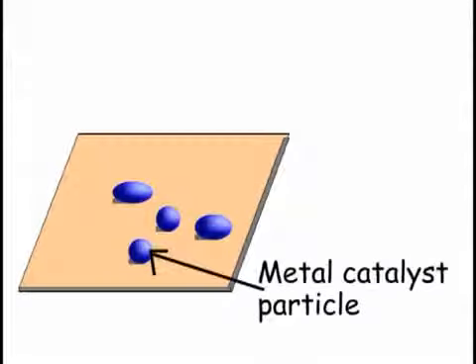In this case, the starting material is not graphite, but some carbon-based gas, a hydrocarbon. We also need a metal catalyst to form tiny particles which will act like seeds. In this CVD machine at Oxford University, the metal is included in the starting molecules. They use ferrocene, which contains one iron atom per molecule. The young scientist takes a clean tube and sets up the experiment. He introduces a clean base in the tube and closes all empty space with heat-resistant cotton to keep the heating.